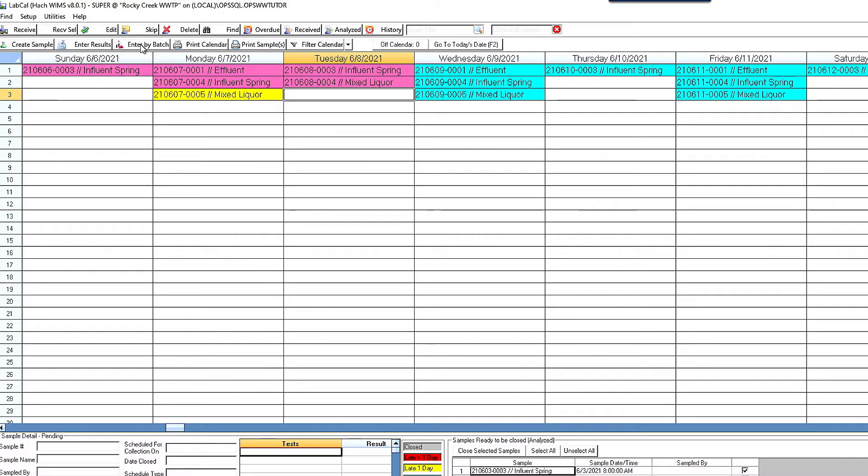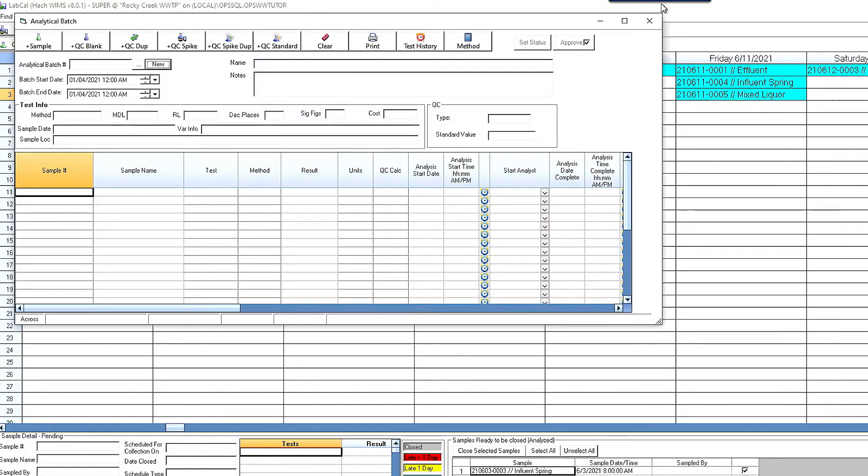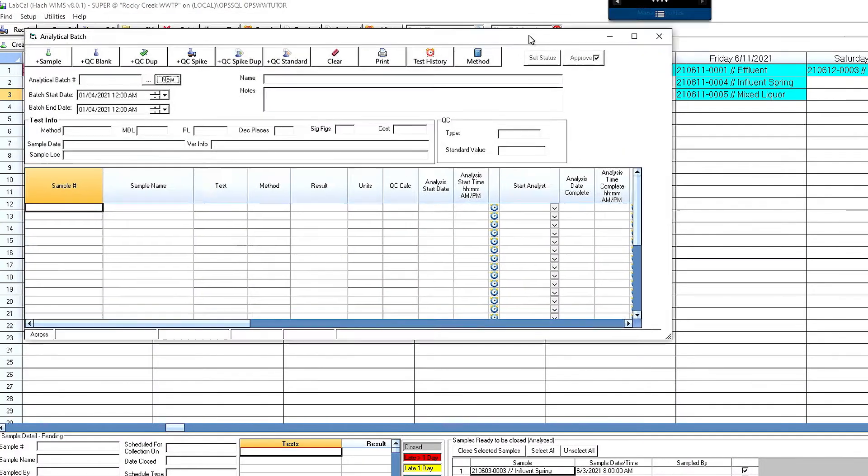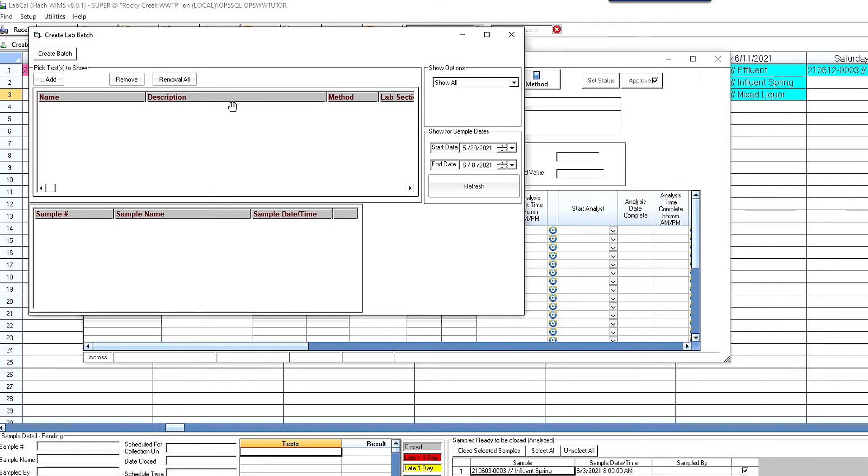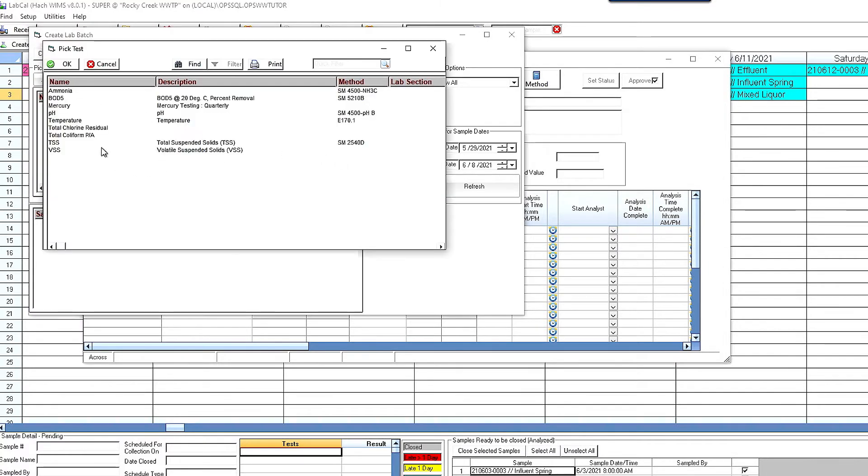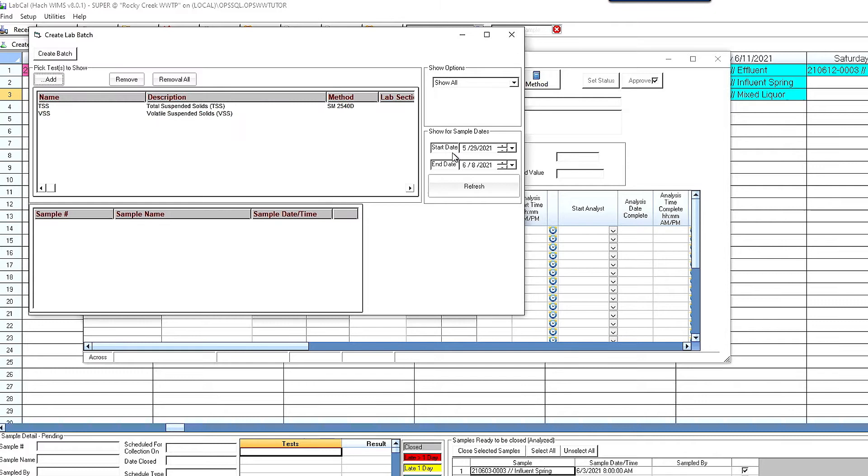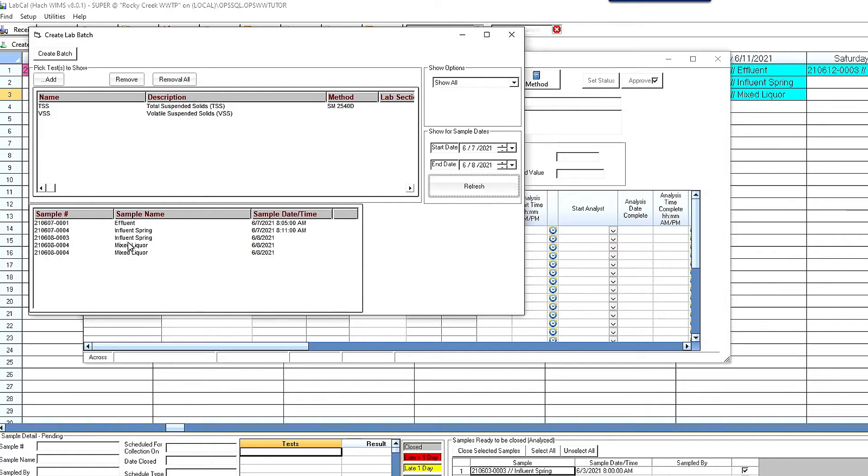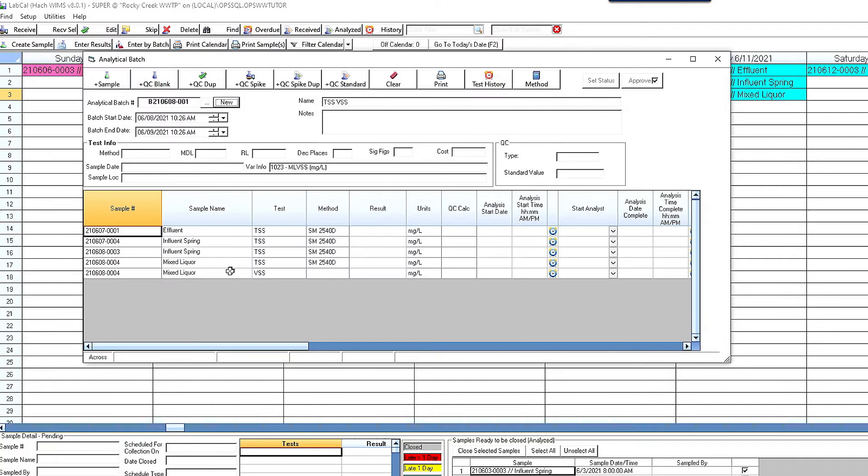So the next thing I want to do is now I'm going to enter results in. So we've got this enter results by batch or by analytical run might be another way to say it. And this is something that's very new. And right here what I'm going to do is I'm going to go ahead and click new. I'm going to set up a new batch. I'm going to add in my tests. And I'm going to set my sample dates. I only want to look at today and yesterday. When I click refresh it's going to show me these are the samples that I have in the lab that are ready to be run that need TSS and VSS that have those tests in there. So I go ahead and click create batch. It's going to assign a batch number to it.